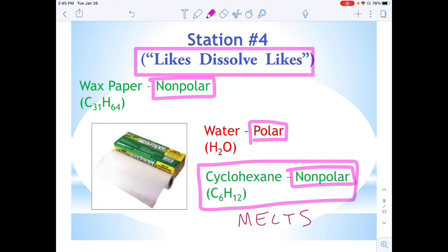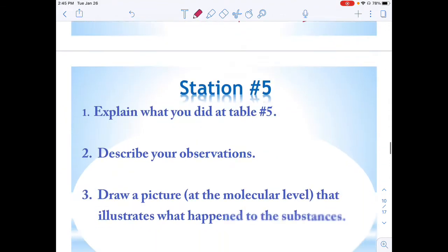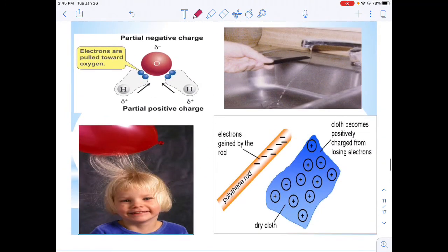The water stayed in a bead on it. And then I was even able to take that toothpick and run it through, and it stuck with it. Again, that has to do with that surface tension, that adhesion, those molecules holding on to each other, pulling each other along.